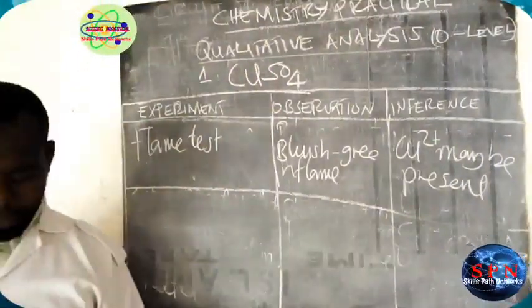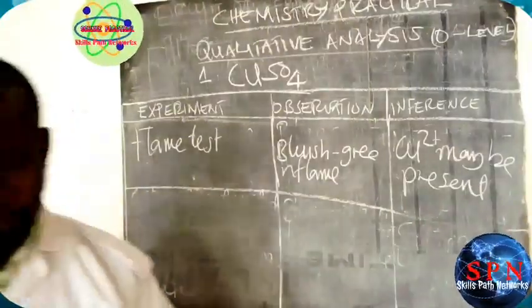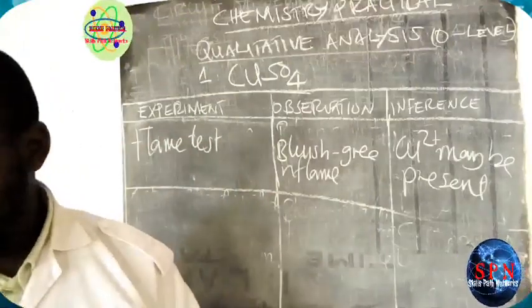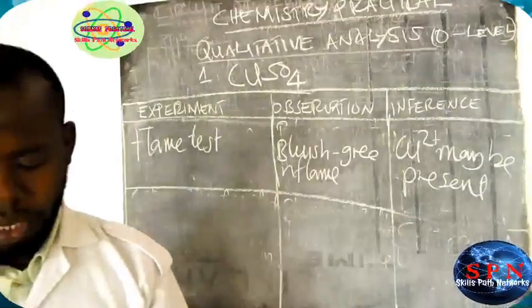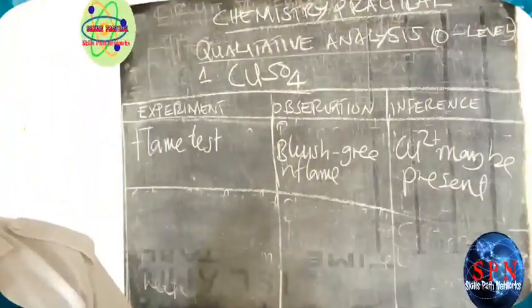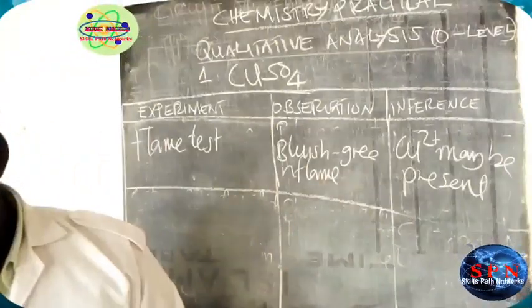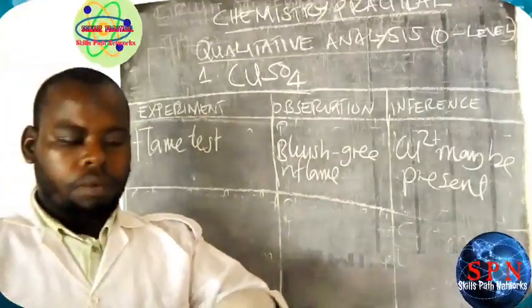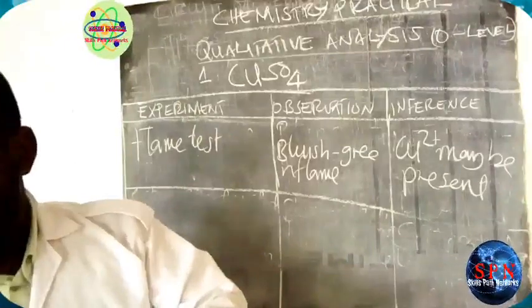After that, we are going to see the solubility of the salt sample. We take the sample and dissolve it in water.